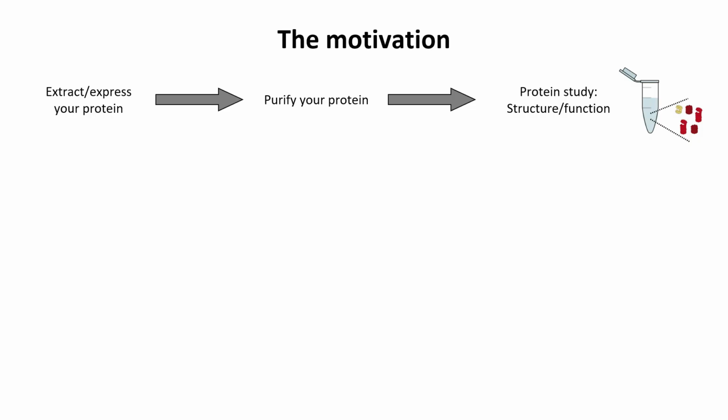So if we start with the motivation, most protein studies start with extracting your protein, or expressing and then extracting your protein from live tissues. Then you work really hard to purify your protein. Here the optimization of your purification protocol will have a tremendous effect on the quality of your study. After purification, you find the best conditions for your study. You screen for different conditions.